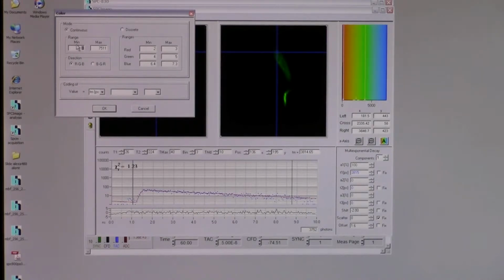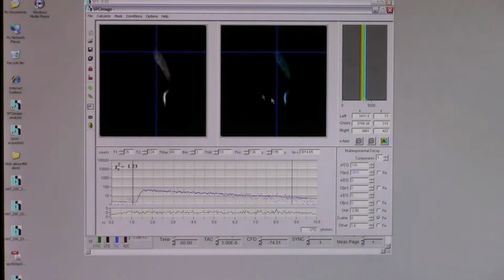So as I just said, for our particular fluorophore, we'd like to look between 3,000 and 4,000 picoseconds. For some reason, all the settings are in picoseconds. If you're used to thinking about it in nanoseconds, then do some math in your head. So once I click that and I set the range to 3,000 to 4,000 picoseconds, you'll see that the color of my lifetime image changes. And you'll see that this range that we set is very squashed. You can actually spread that out by pressing this button right there.